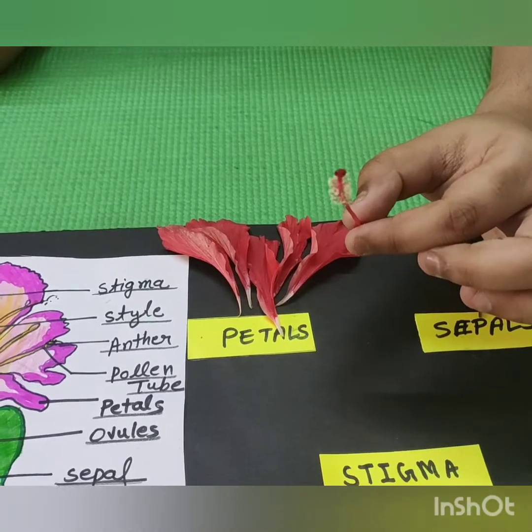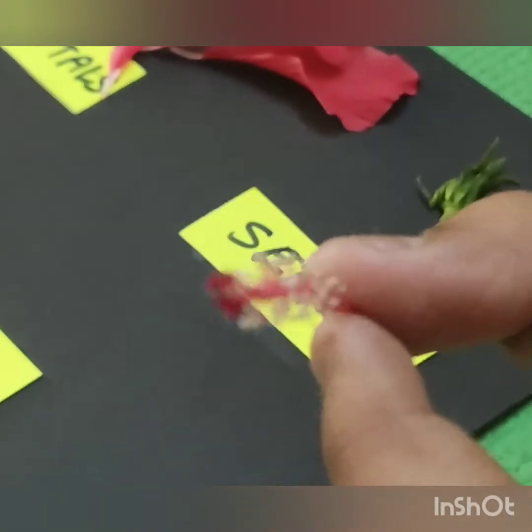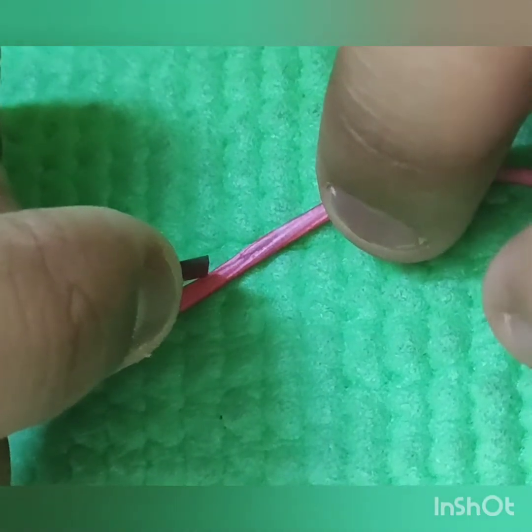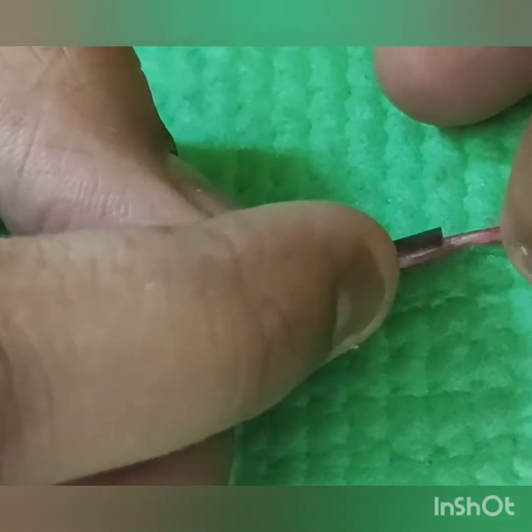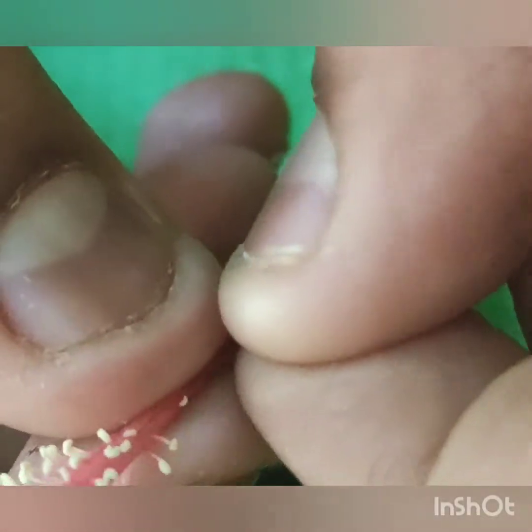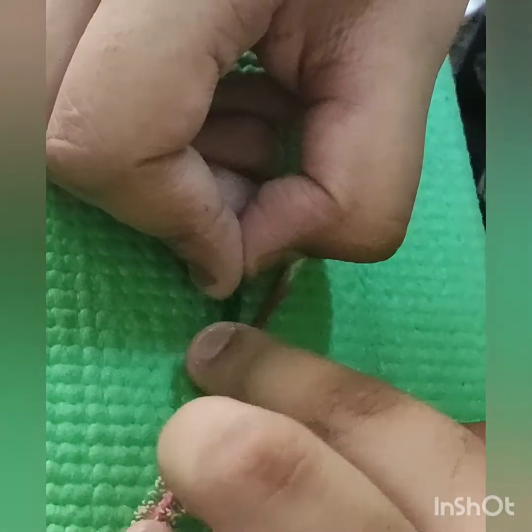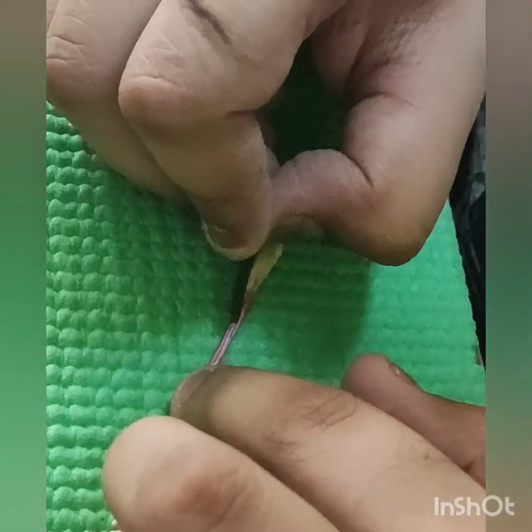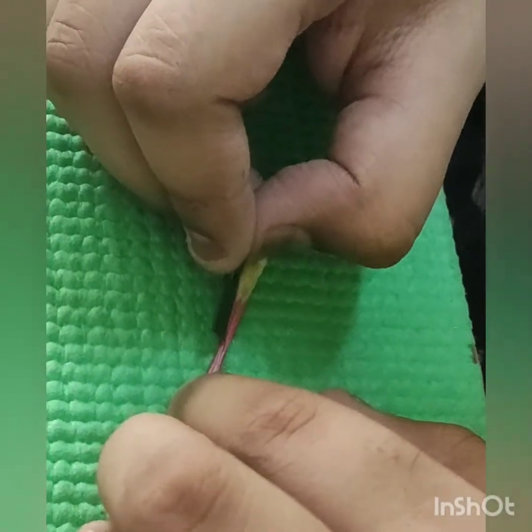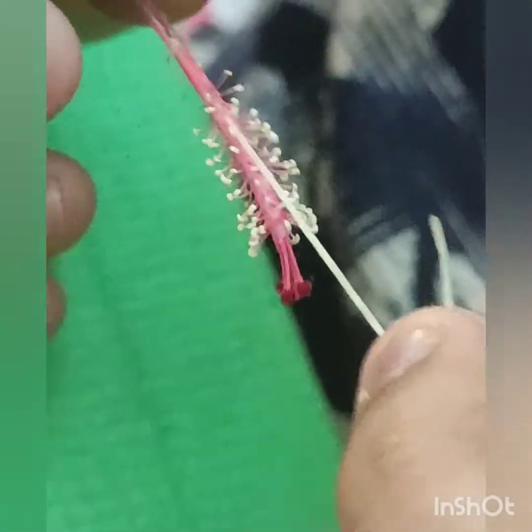Next, I want to examine the pollen. The next part involves slitting open the style of the flower. I slit it open — you can use a blade or any other tool. I use a blade to separate the style. Do this very carefully. I am cutting the stigma carefully. This is a very delicate part of the flower. It has the pollen grain and style. It is the female reproductive organ.